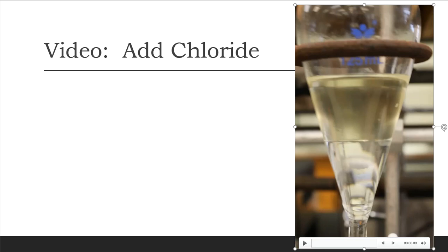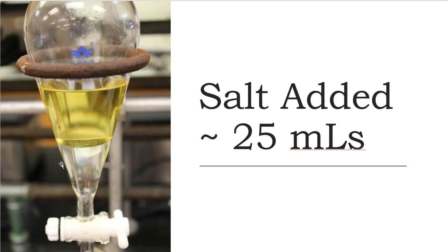However, keep a look at what you're seeing on your screen right now. This is what it looked like with the first addition of the sodium chloride, folks. Notice that this organic layer up at the top was still like a urine yellow color. I know that sounds disgusting, but look at it. That's what it looks like to me.